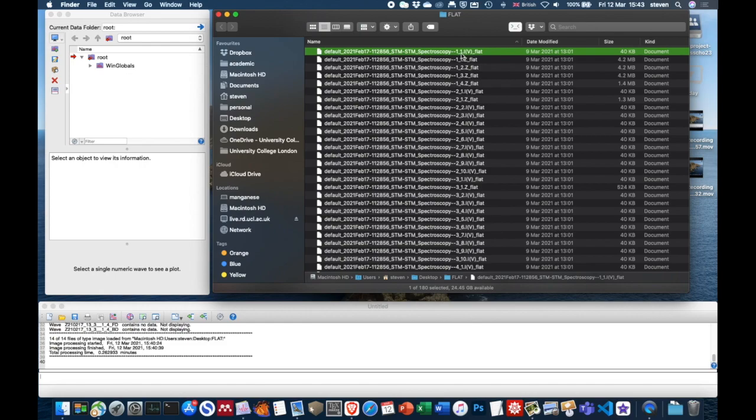And if we took multiple repetitions, then it increments the second number. So the fact that there's only 1_1 means it's just one of those first spectroscopy files. And then when you look at the next one, 2 underscore, there's 2_1, 2_2, 2_3, 4, 5, 6, 7, 8, 9, 10. So just remember, in the second measurement, we set the repetition number to 10, and we clicked and we got 10 repetitions in one.